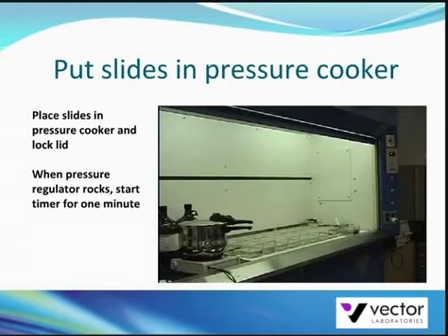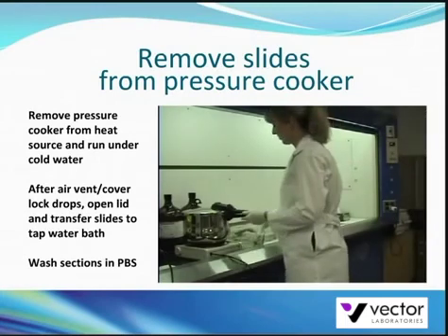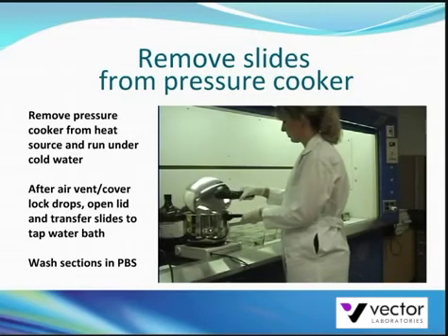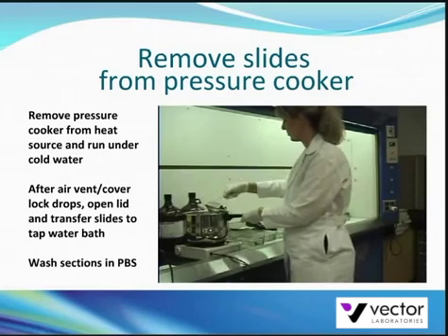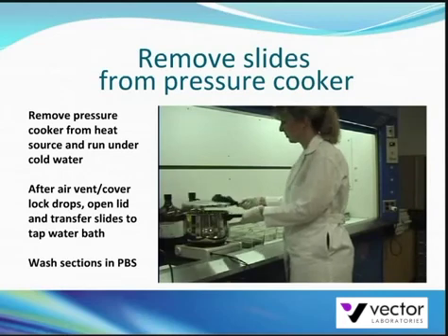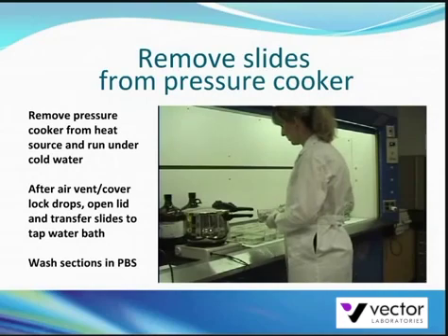For your safety, do not open the lid until the internal pressure of the pressure cooker has been completely reduced and the air vent cover lock drops. After the air vent cover lock drops, open the lid, remove the slides, and place them immediately into a tap water bath. Do not let the sections dry out. Wash the sections in PBS buffer for 5 minutes and continue with the staining protocol.